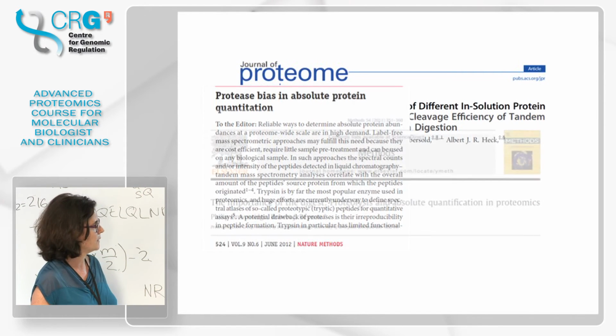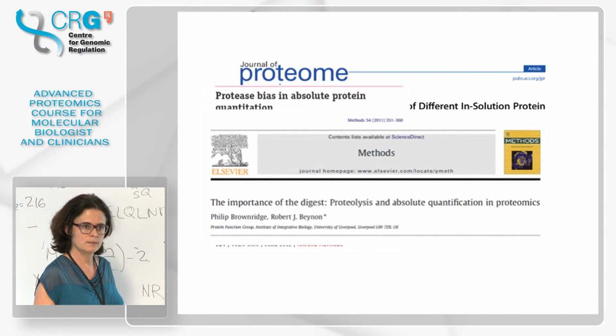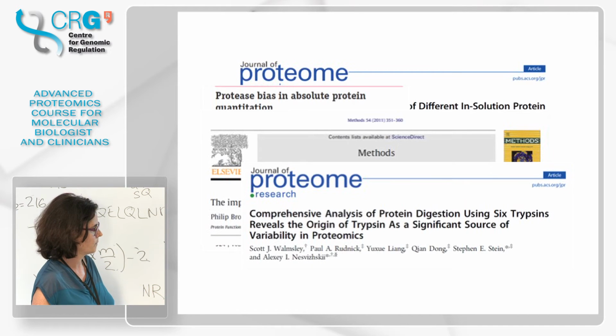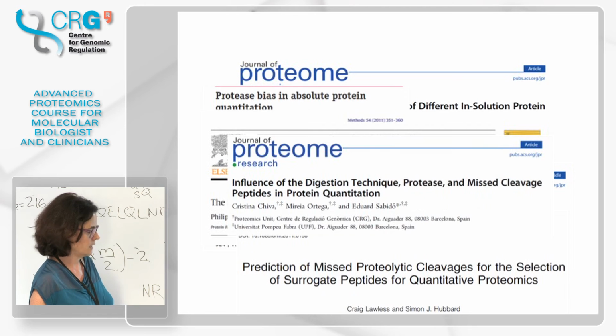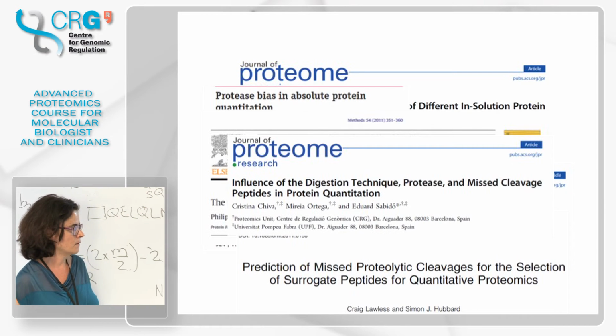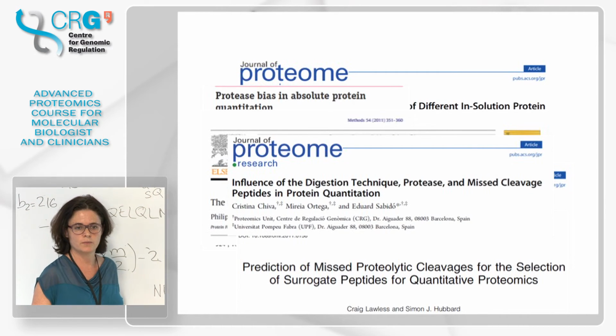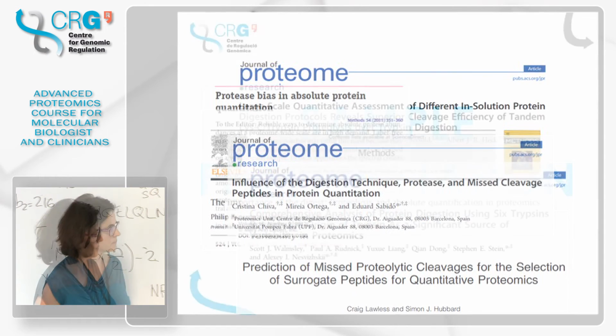So it seems easy, but we need to pay attention, especially when you are doing quantification. The digestion is very critical. Here are some examples of articles. We have even done one article about digestions. As I told you, it seems a minor thing, but you need to be careful and optimize your sample and your digestion in order to get good results.